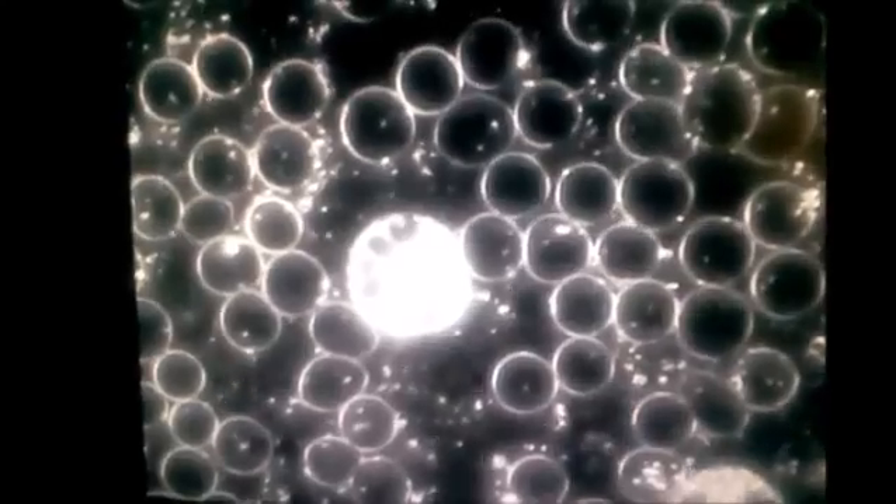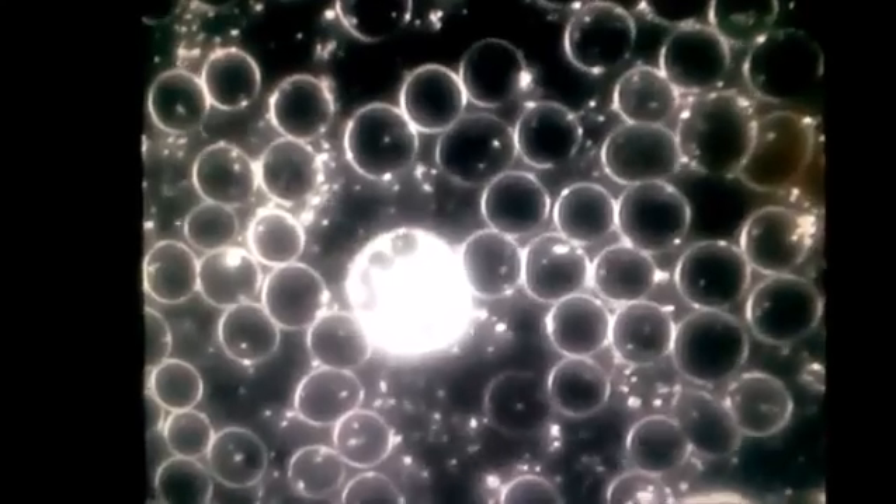Here is the one hour after the sole product video. The red blood cells are perfectly round. They're kind of touching each other, and that's okay — they've only got so much space. In the center, you see a white blood cell with four lobes inside, so this is a good white blood cell as well. This is the fourth and final stick. I'm very pleased with how the blood is looking now. From the first video to the last, the red blood cells are not shiny inside, they're all round, they're not clumped on top of one another, and not linked together. Now the cells are free to take the oxygen and nutrients throughout the body, nourish the body, and oxygenate the body.